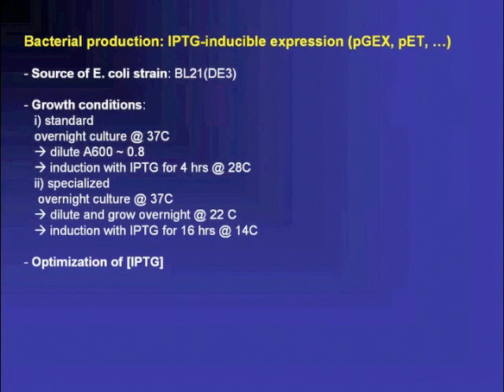In principle, it would rather depend on the biophysical and biochemical properties of the peptide sequence, whether it would be able to be produced and whether it would be soluble or not, rather than on the bacteria itself. Yeah, because you get lots of different E. coli strains for producing things like toxic proteins. Yes, here we stick to BL21 DE3, but other strains that lack certain proteases might be suitable for you, and that's perfectly fine, as long as you can produce your peptide in it.